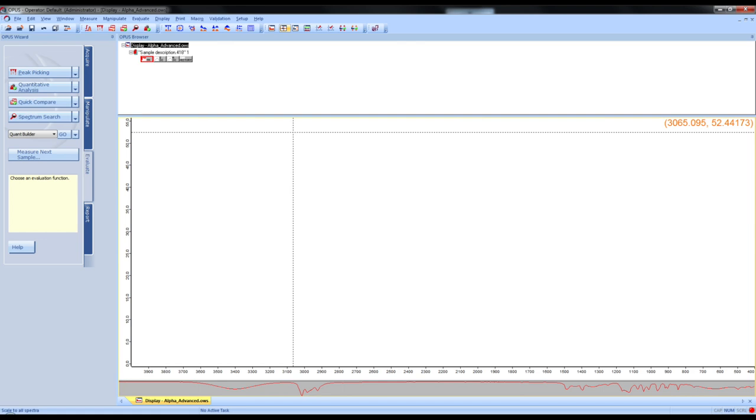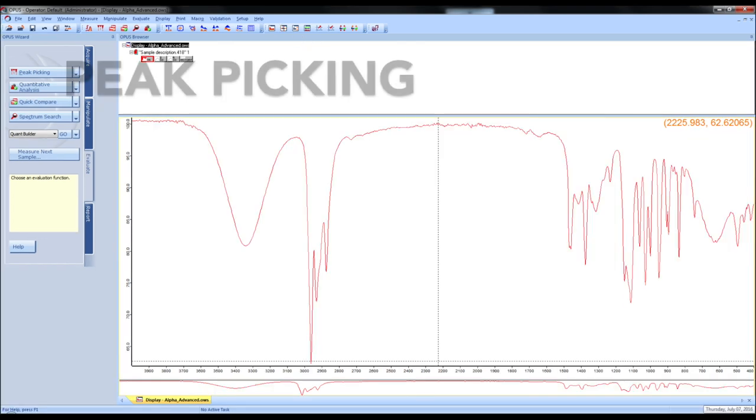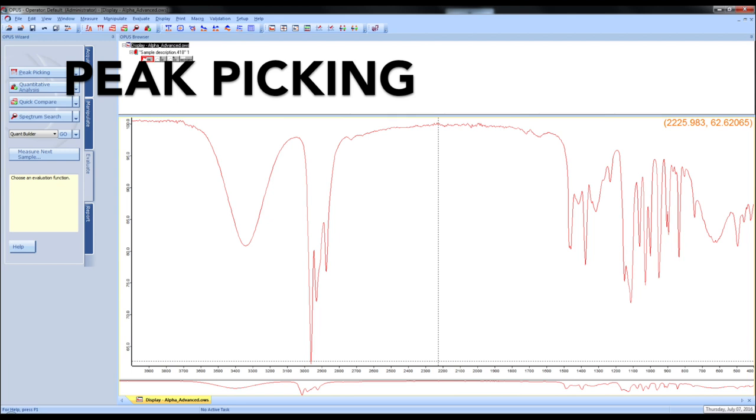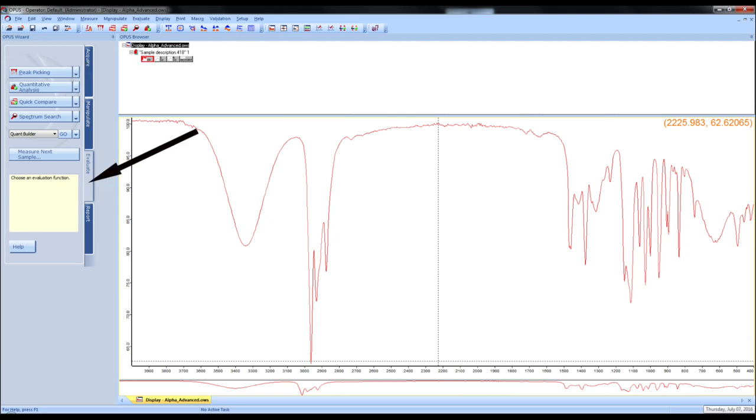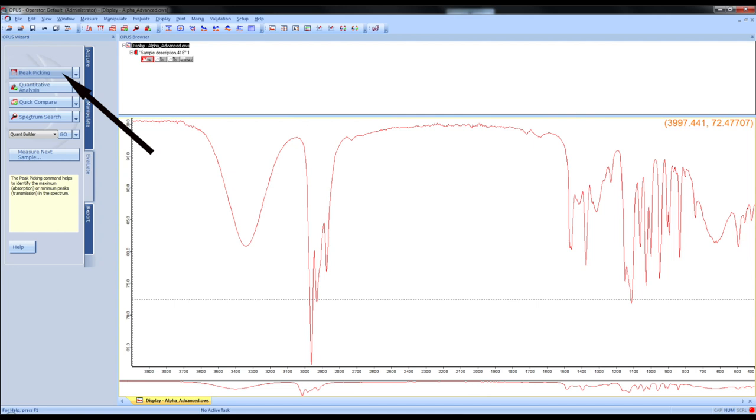To adjust the Y axis, click the scale button on the top menu. If you want to do peak picking, click the evaluate tab on the left corner of the screen and click peak picking.